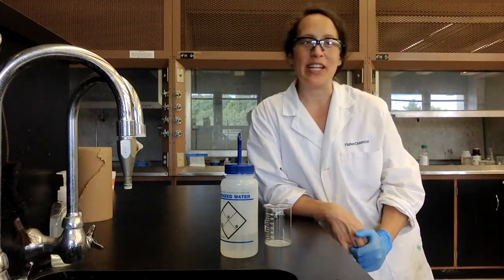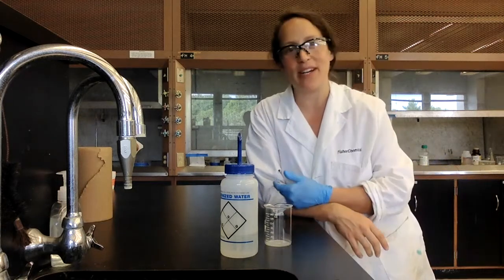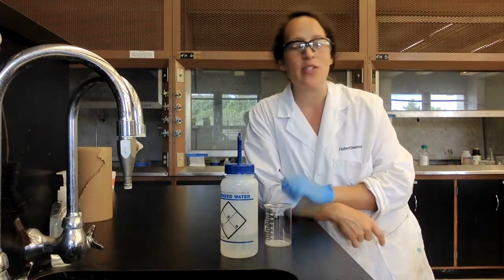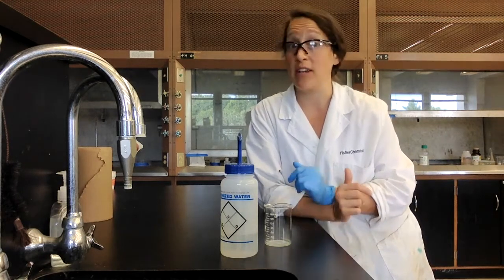Okay guys, so another question we usually get asked a lot is, can I use tap water or do I need to use deionized water? So what are the differences between those two and how could that possibly affect whatever it is you're doing?